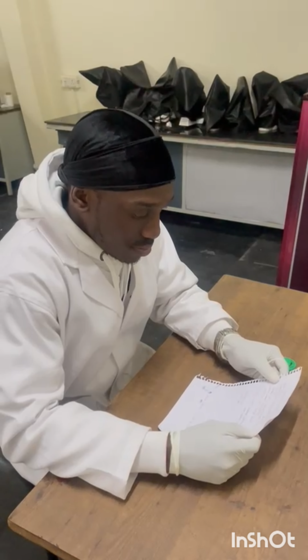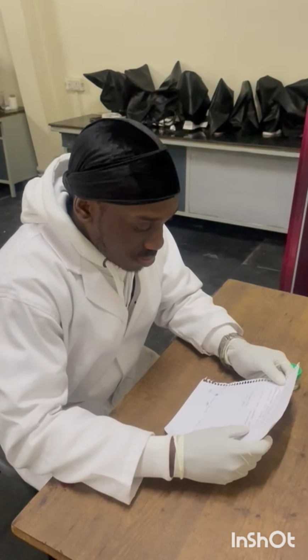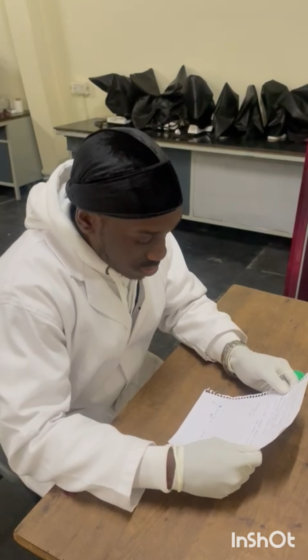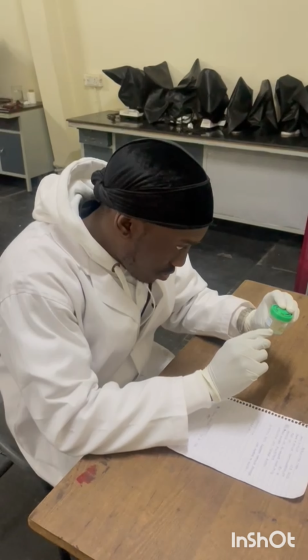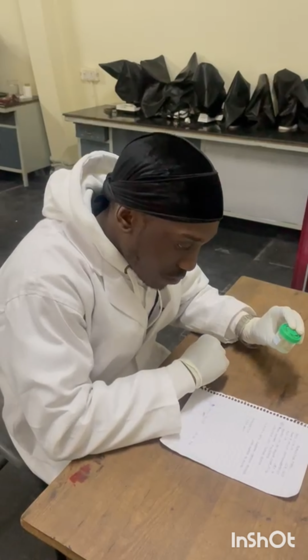Tissue samples are collected from patients with various methods such as biopsies, surgeries, and autopsies. Sample labeling. Samples are labeled with patient information, specimen type, and relevant clinical information. Sample transportation. Samples are transported to the histopathology laboratory in a secure and timely manner.